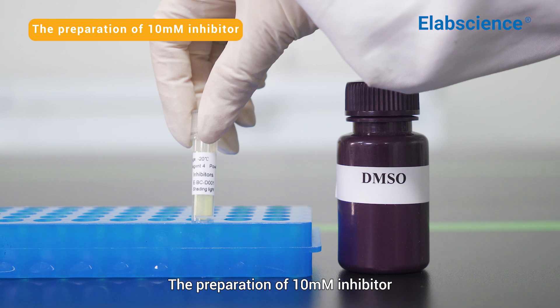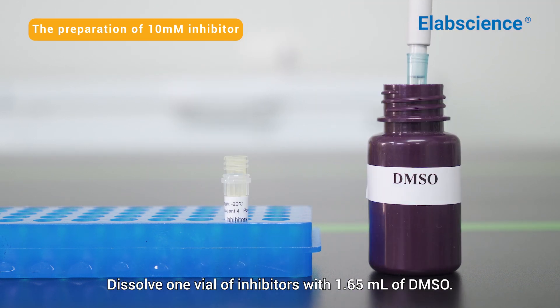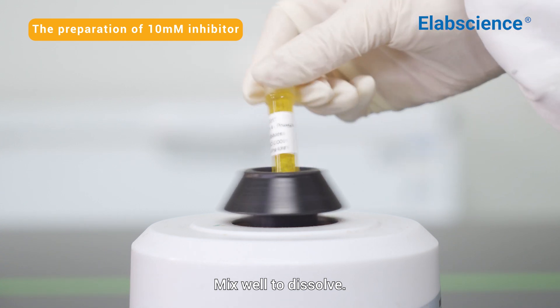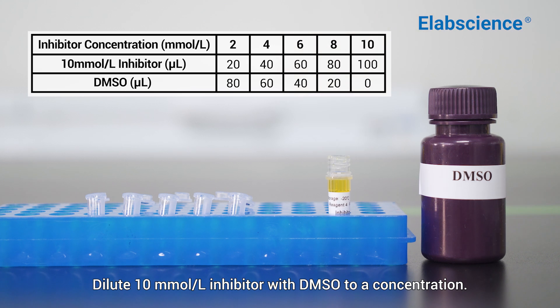The preparation of 10 millimoles per liter inhibitor: dissolve one vial of inhibitors with 1.65 milliliters of DMSO, mix well to dissolve. Then dilute the 10 millimoles per liter inhibitor with DMSO to the desired concentration.